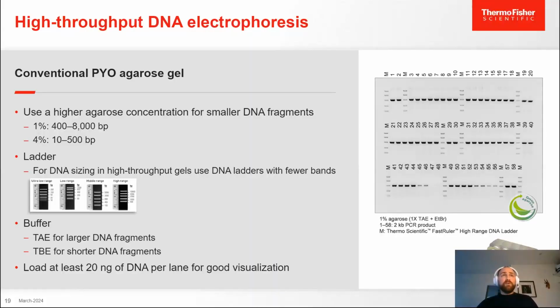The benefit of traditional electrophoresis is basically the inherent high throughput, because you are the one controlling how many wells it will have. So generally, for high throughput electrophoresis, you can make up to 180 wells if you so wish, depending on the density of the combs that you can accommodate within that gel.